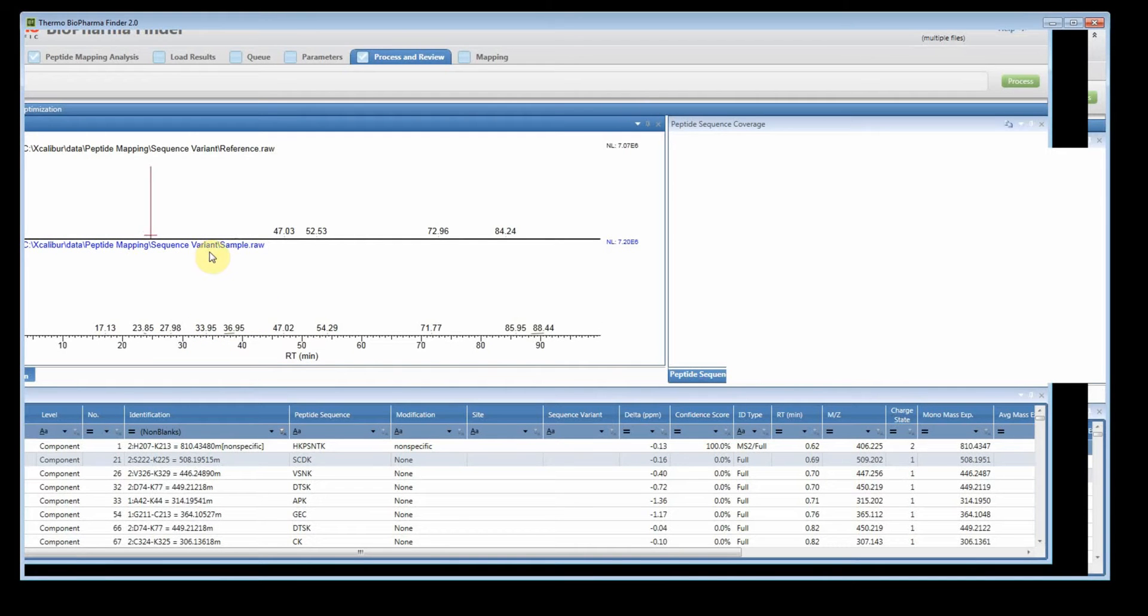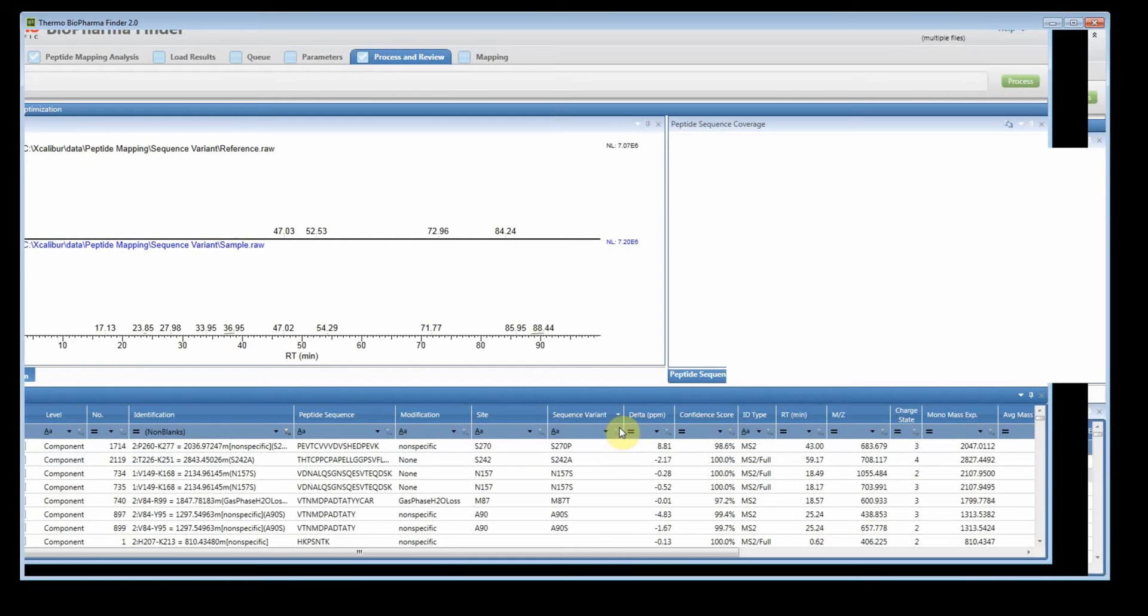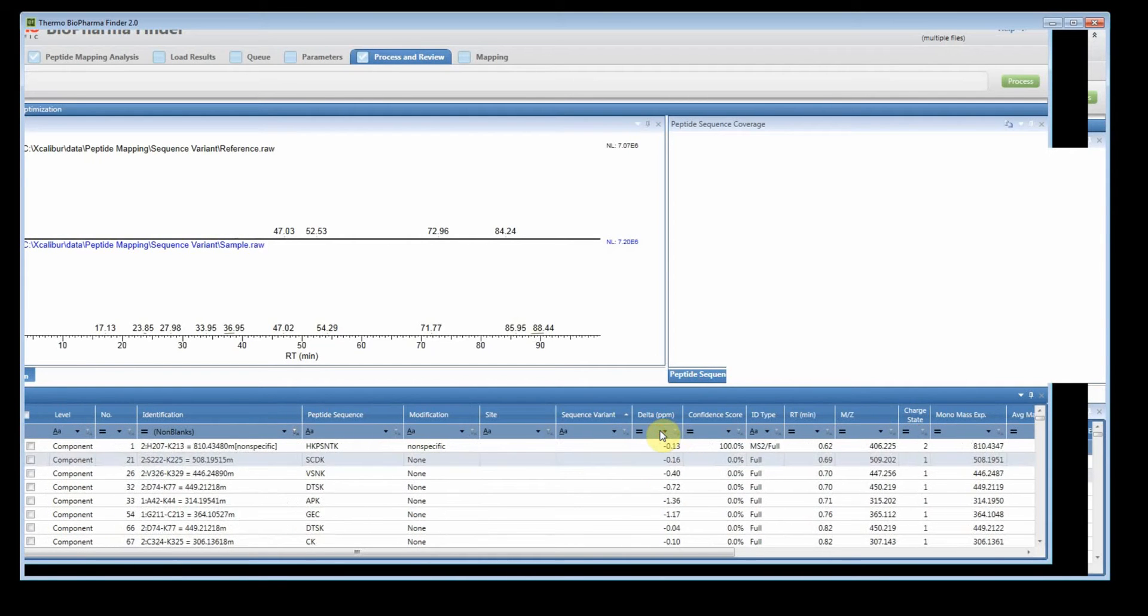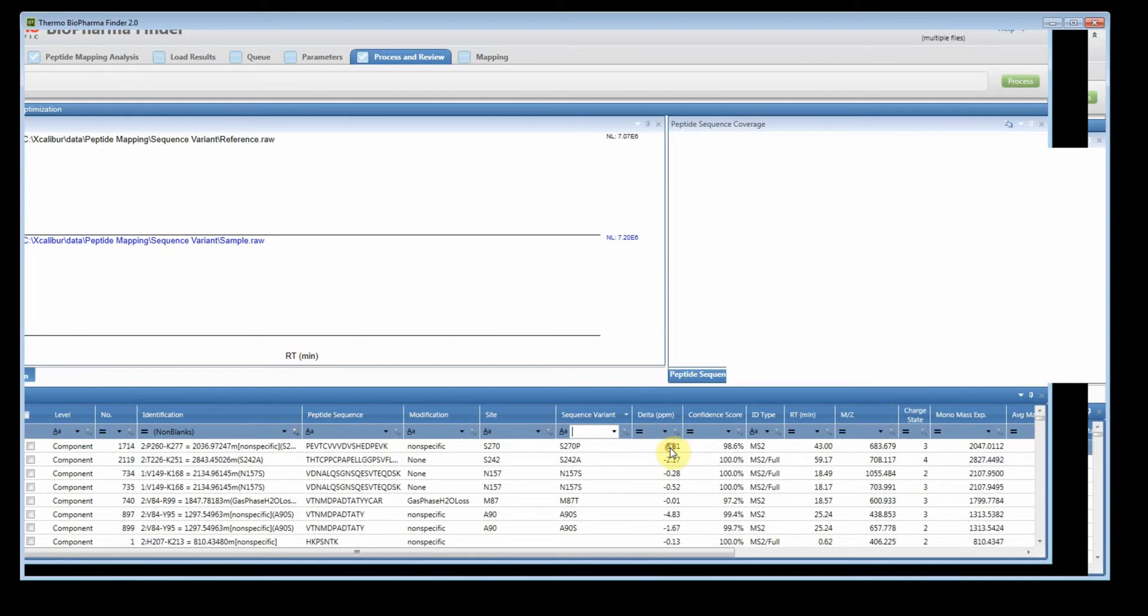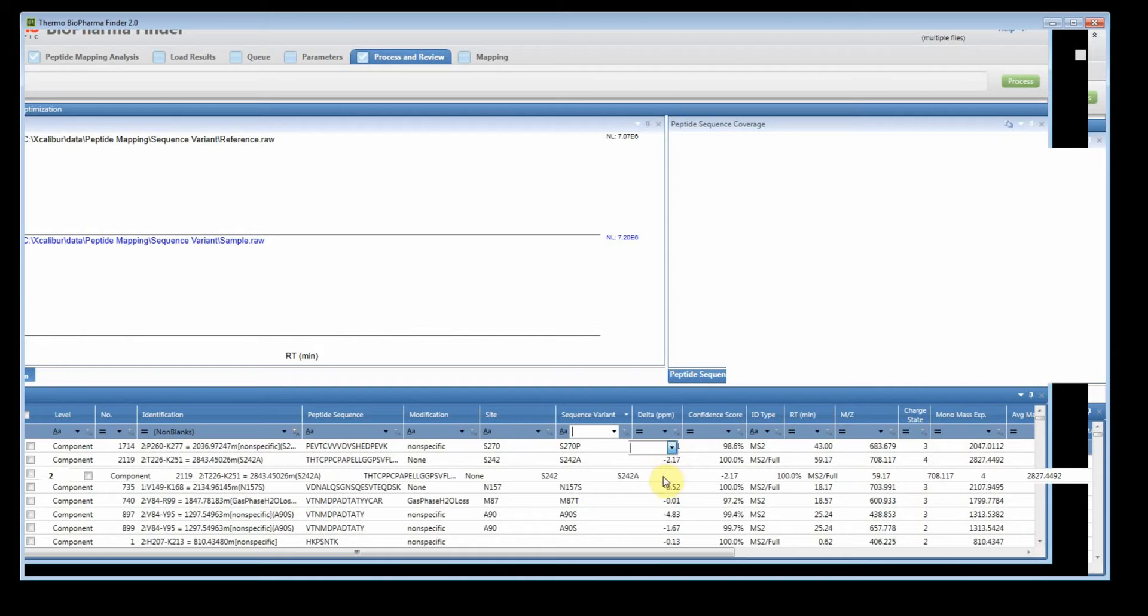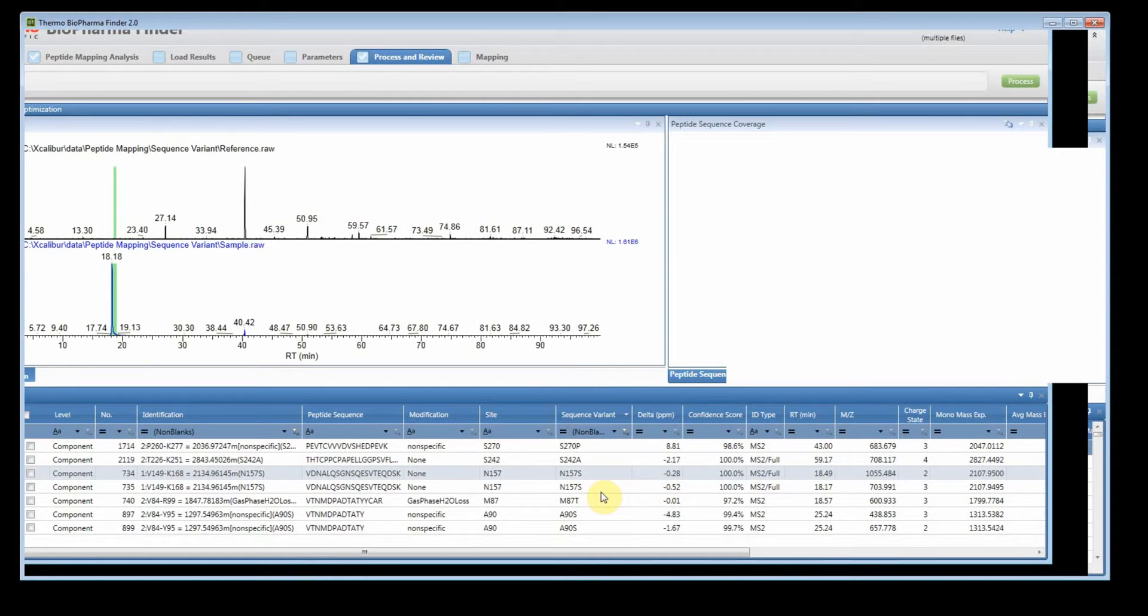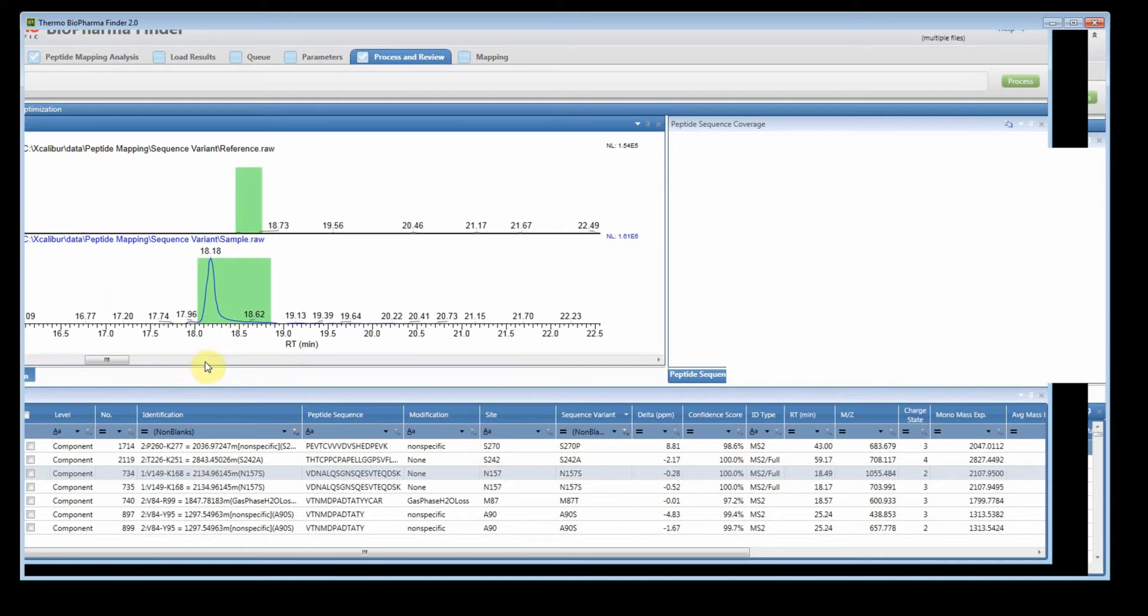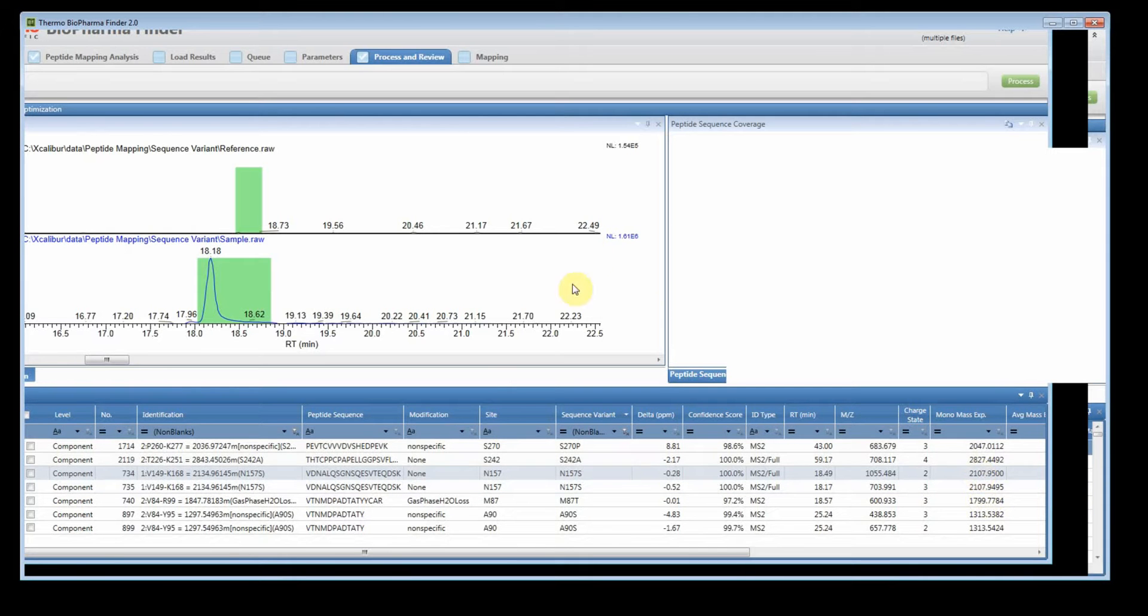Now we can see both files. Now because this was a sequence variant search, you could actually filter by this column. So you can sort by clicking here or you could say show no blanks, so non-blanks. So this was the actual spike that was spiked into the sample and you'll clearly see that it is in the sample, not in the reference and you have the different charge states.